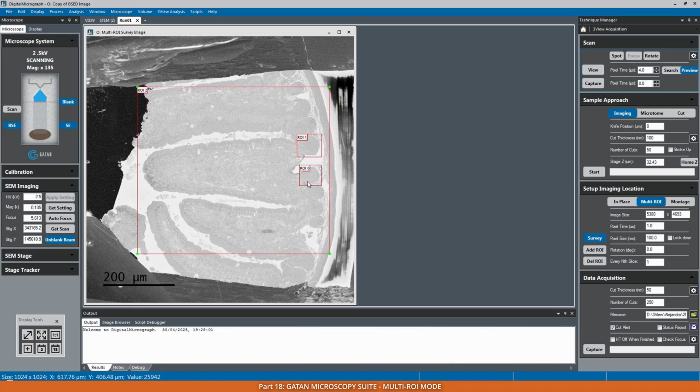And what I can do as well, I can specify whether I want to collect this ROI every section, or maybe each 20th section. Because this is my overview, I probably don't want to have it each section, so I can say, okay, please do it each 20th section.